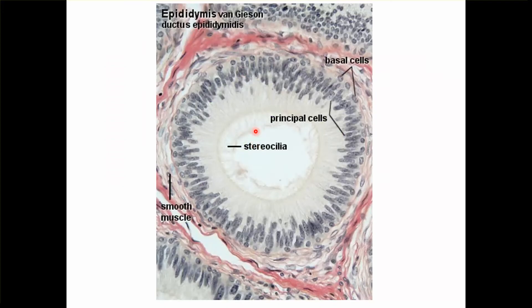Another slide to show the epididymis using a different stain — Van Gieson stain. You can again see the pseudostratified epithelium with stereocilia. The cells are made up of principal cells — the columnar cells — and the basal cells.